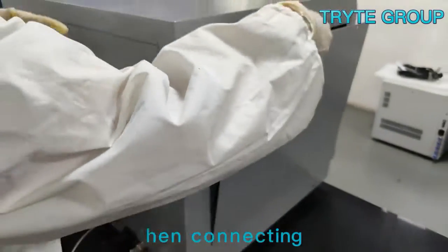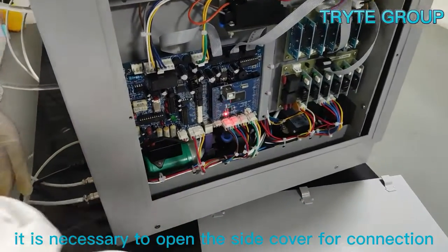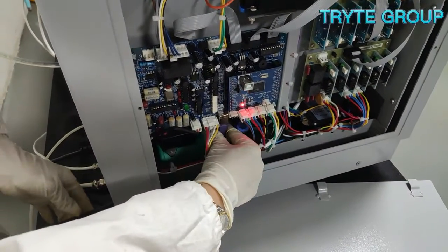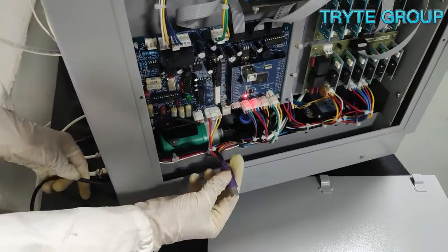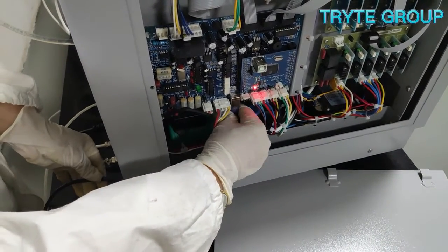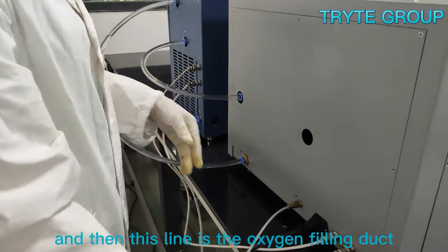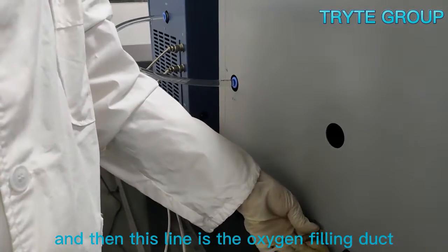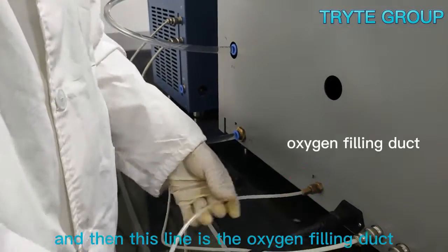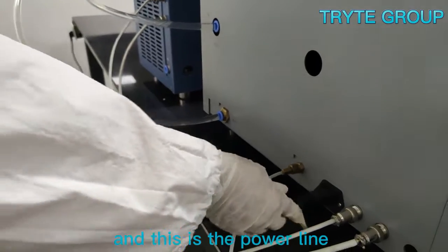This is the data line connected to the computer. When connecting, it is necessary to open the side cover for connection. This line is the oxygen filling duct, and this is the power line.